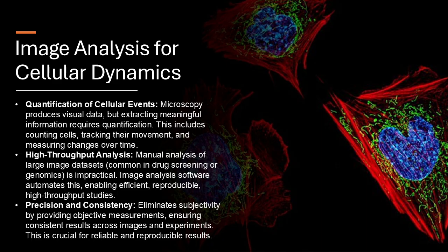Then we can measure everything: size, shape, intensity, and location. Wow. And we can track all those things over time. We can, and we can compare different cells. So it's like having a whole new set of eyes to see the cells. Right, and we can visualize it in so many ways. Like how? Graphs, charts, heat maps, even videos. So we're turning the cells into a story we can understand.